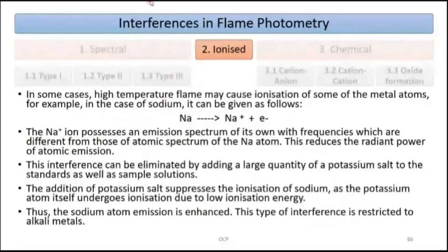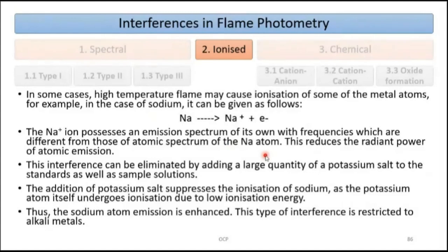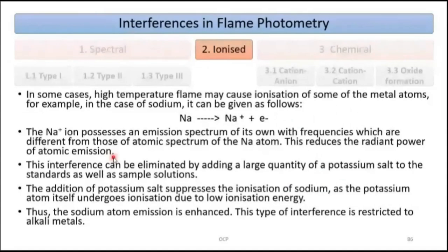Ionization interference in flame photometry: at high flame temperatures, some metal atoms may undergo ionization. For example, sodium loses an electron to form sodium ion (Na⁺). The sodium ion possesses its own emission spectrum with frequencies different from those of the sodium atom. This reduces the radiant power of atomic emission — out of 100 sodium atoms, if 20 are ionized only 80 absorb, so the detector reports fewer atoms than actually present.